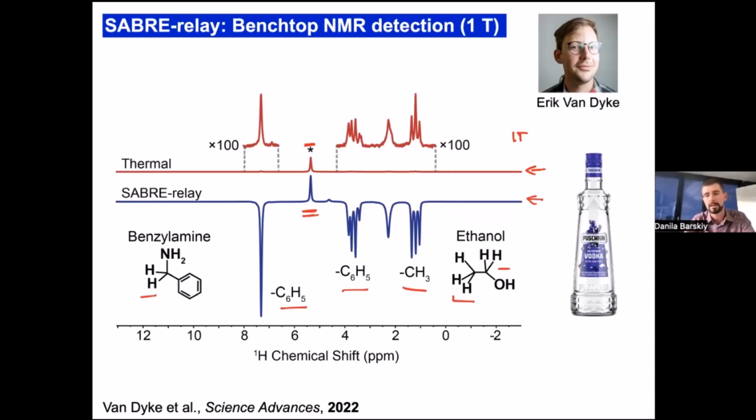So I think the analytical potential of this technique is quite amazing, and I don't think it's fully explored actually. And I invite many more groups to explore it. If you have a benchtop NMR spectrometer, if you have these simple chemicals, you don't really need to use deuterated solvents. You can work in protonated solvents now. Actually, there are also techniques for solvent suppression. So I think we're entering a very interesting time when a lot of research can be done in a straightforward manner and with relatively small investment, so to speak.